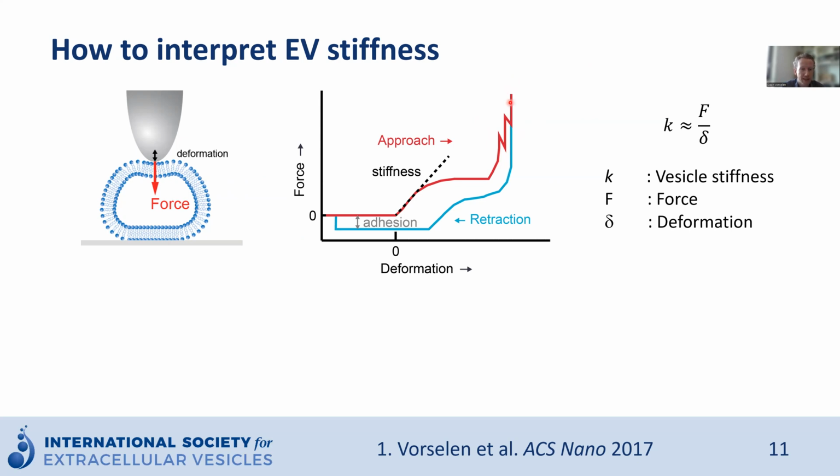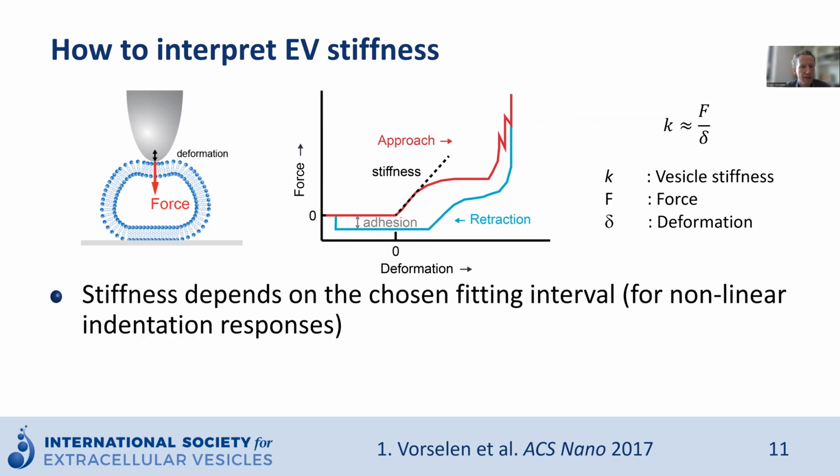Then, when we retract the cantilever tip, as shown here in blue, we can see a slightly different response, and also we can see that there's adhesion of the tip to the vesicle. So you can use these curves to fit the stiffness, as also illustrated in the graph. But since you have a not entirely linear response, this stiffness does depend on the chosen fitting interval.